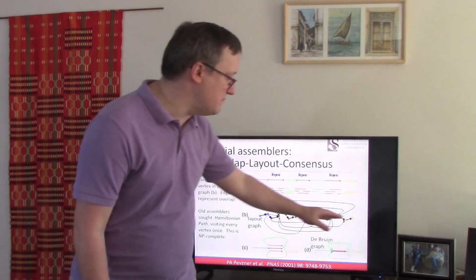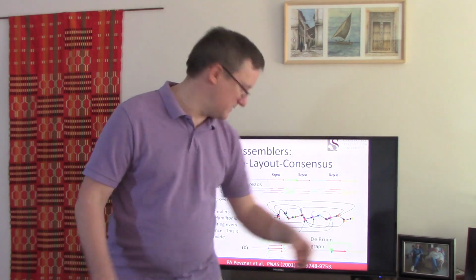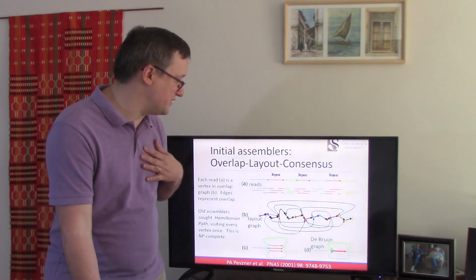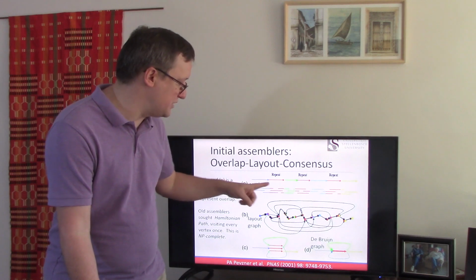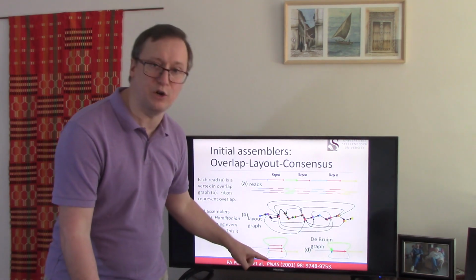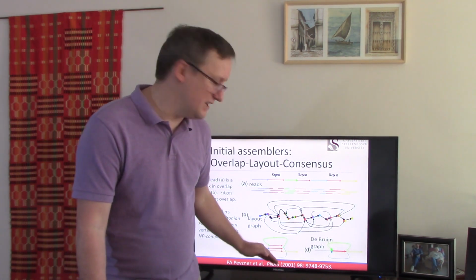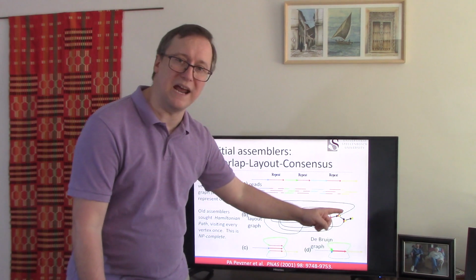So it might seem then that there are lots of different ways that we can interpret this. We know in our heart of hearts that this starts with a dark blue region that continues to a red, that continues to a green, etc. You can see that path is shown here. But the data don't tell us that. The data tell us that there are many paths here.